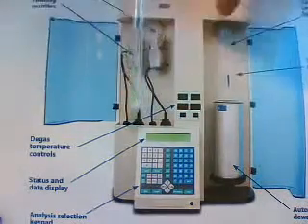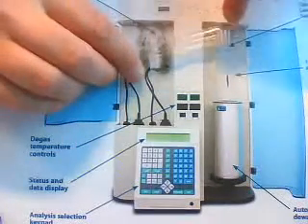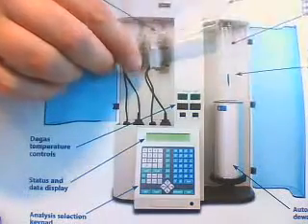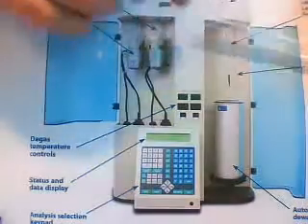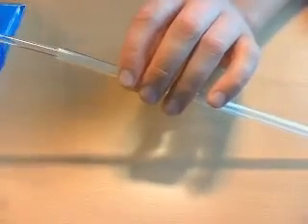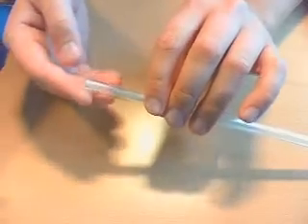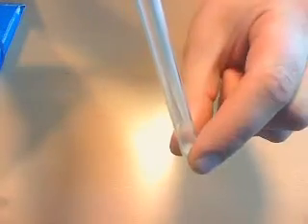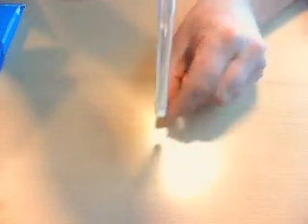Then the sample is ready for the measurement and it's placed in the measurement station over here. The same rules apply — be aware that you don't break the capillary as it's fragile. What is also used during the measurement is a solid glass rod, which is inserted into the capillary. It's just a solid piece of glass, but the trick is it occupies part of the dead volume to make the measurement more accurate. It has a small pointed end which makes it stick up and not fall to the bottom, so it sits just slightly above the sample. In this way you can measure the surface area more accurately. Once this is done, it can be inserted into the BET system and the measurement can be started.